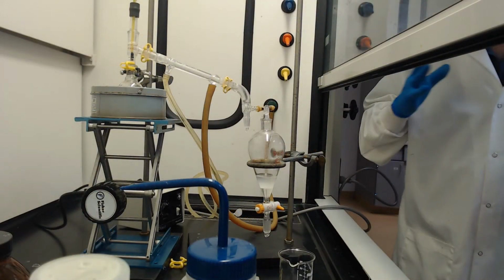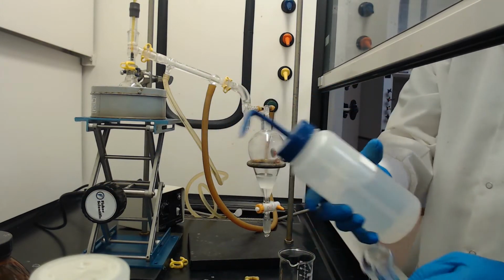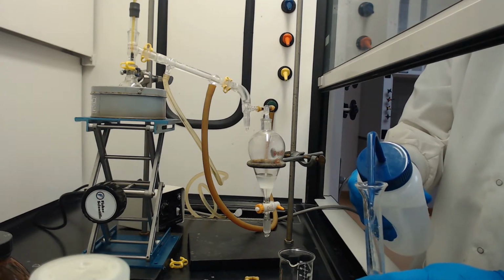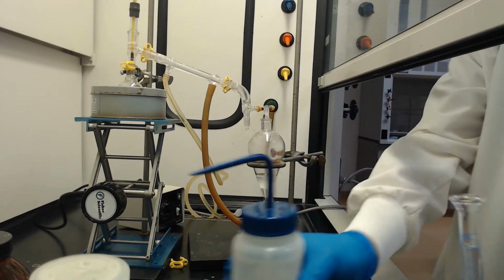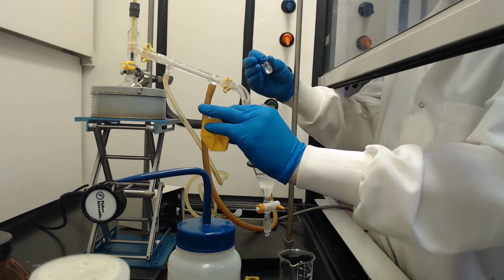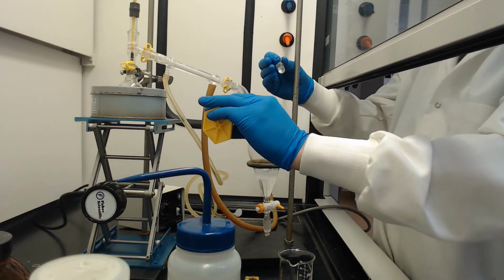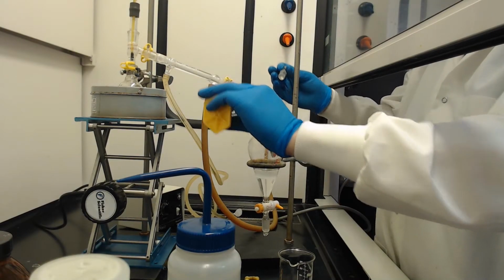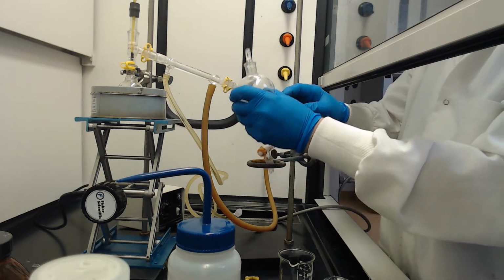All right, so we're going to do some extraction here. It says to use, I've got DI water here, and this doesn't have to be super accurate, but it says 10 mils, so you get this up to about 10 mils. Now this is acidified, so apparently some of the acid comes over in this distillation. So I'm going to add that. If we do the water drop test, we can do it right now. Where is all that going? It's going into that bottom phase, as we would expect. Top phase is the organic. Bottom phase, we can confirm by looking up the densities.